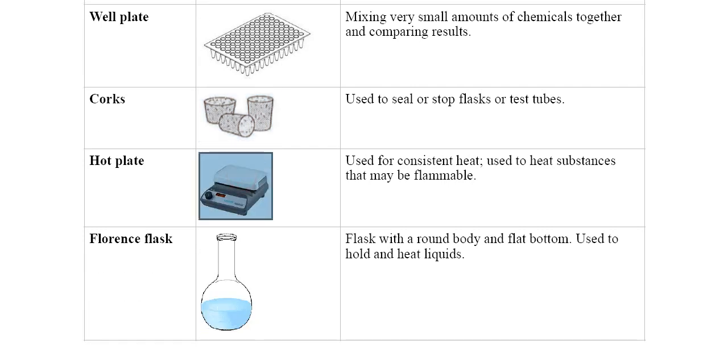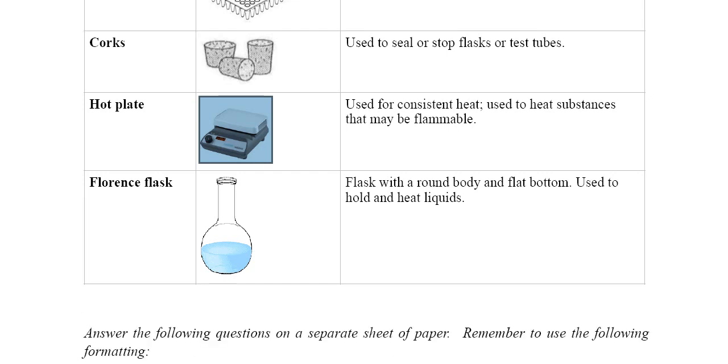Hot plate. Used for consistent heat. Used to heat substances that may be flammable. Florence flask. Flask with a round body and flat bottom, used to hold and heat liquids.